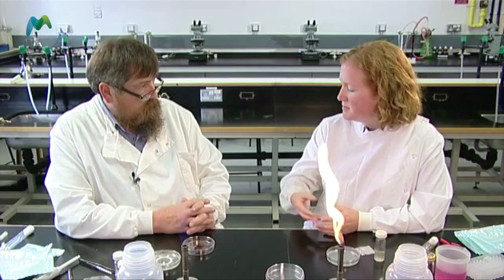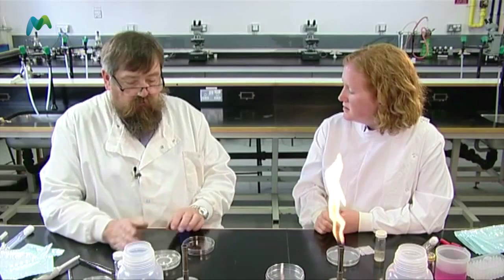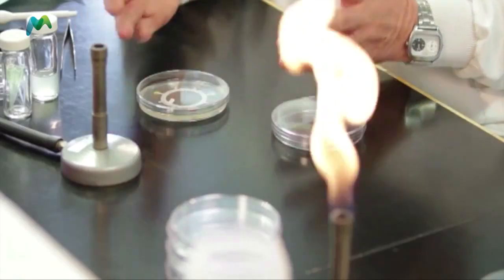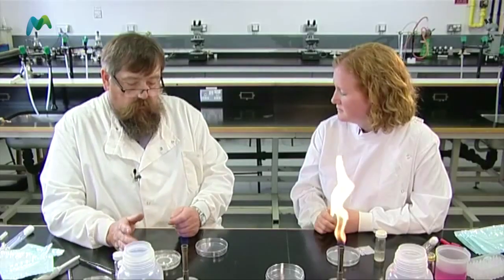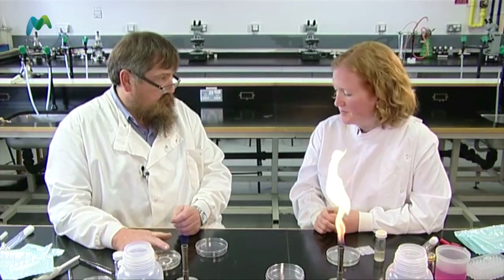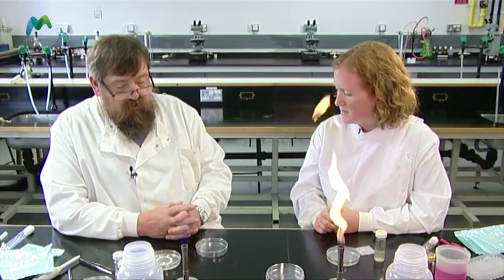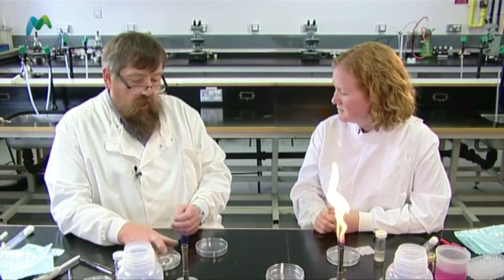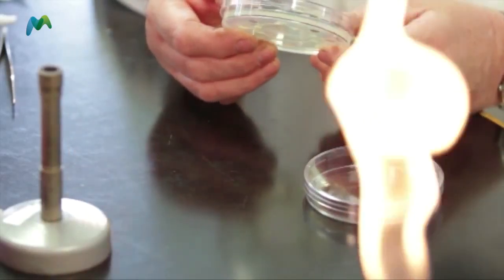Now, if we were preparing that in a prep room, could we spread the plates first and then take them into the classroom? If you leave the culture for any length of time, it will start to grow and the zones you see won't be very clear. So what I would tend to do is get the pupils to put the culture on, spread it, and then put the disc on. Or if it's done about five or ten minutes before the class comes, that's okay. But if you leave it for any length of time, the culture will grow and the zones won't be clear at all.